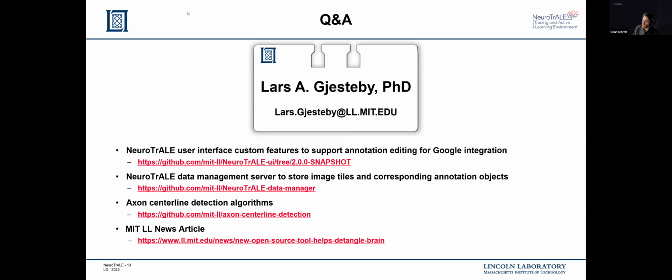Did NeuroTrail let users move through the segmented neuron path? Yes, right. So in that 3D view example I was showing, highlighting a fiber of interest, yes, the user can follow that through the 3D volume and remain focused on that annotation of interest.